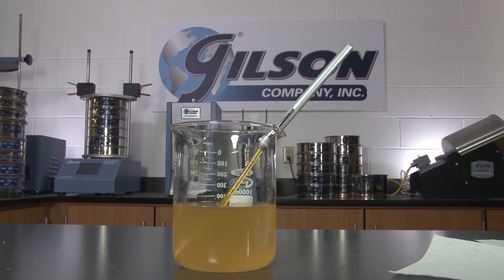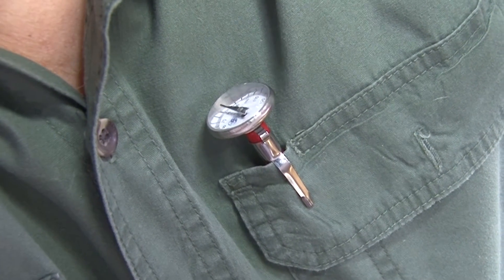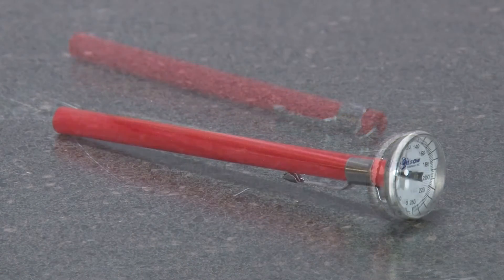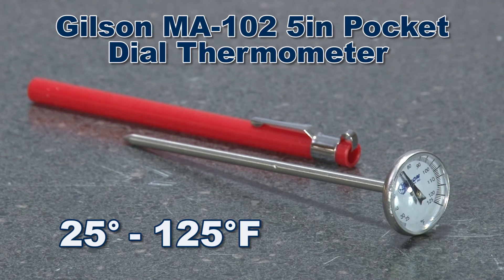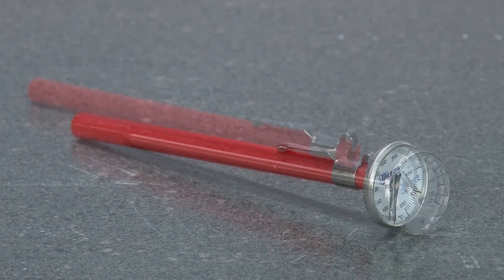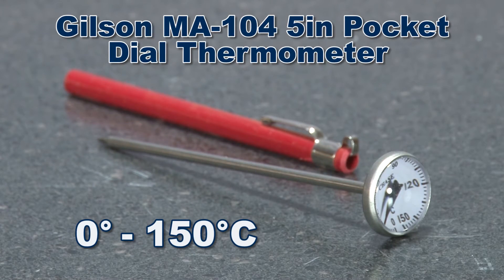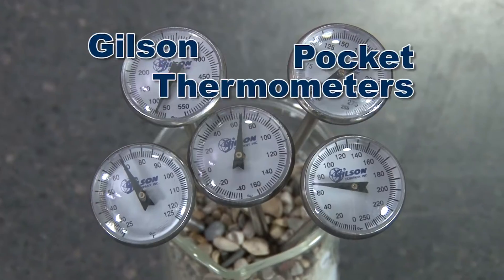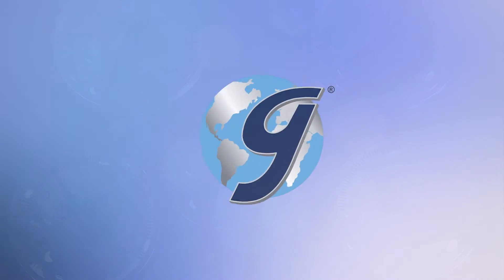For traditional dial pocket thermometers, Gilson offers several adjustable dial pocket thermometers to choose from, with temperature ranges from minus 40 degrees to 550 degrees Fahrenheit and everything in between. Each unit has an accuracy of 1% and comes with a protective probe sleeve, making Gilson pocket thermometers the right choice for your material testing lab.